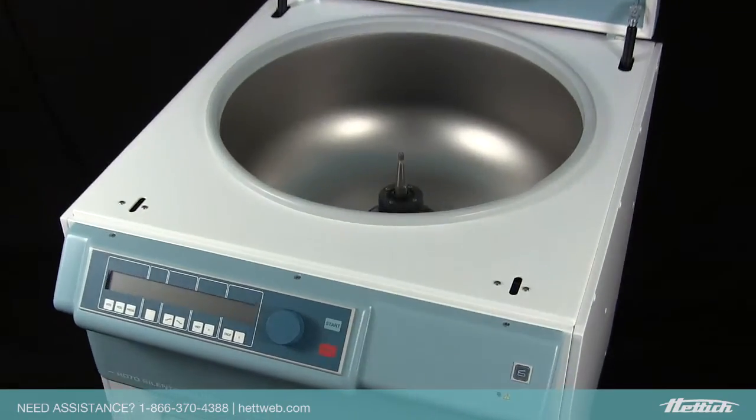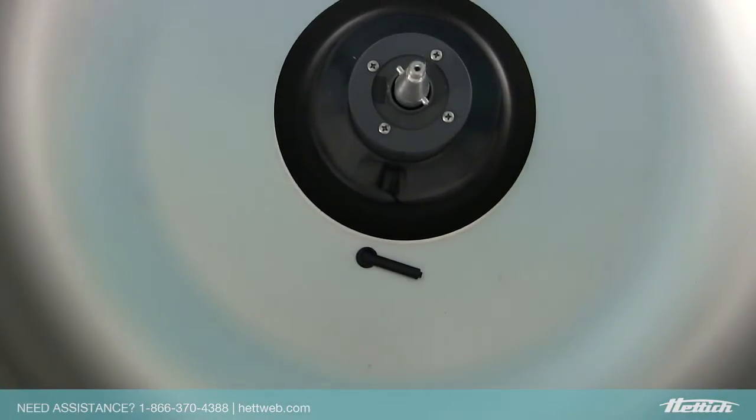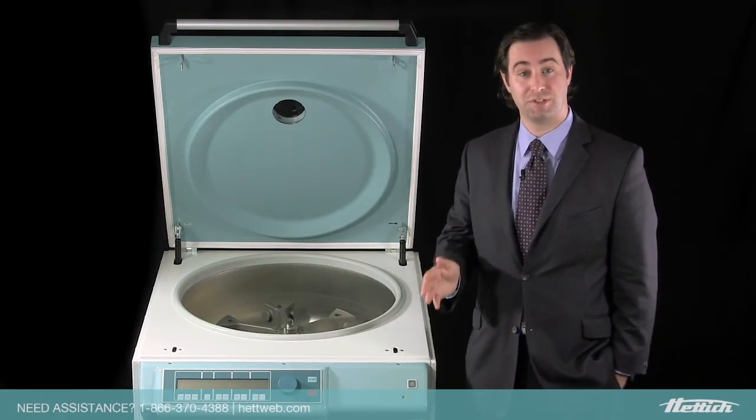With dual temperature gauges and a more powerful motor, the Celenta distributes its force and cooling more effectively and evenly around your samples than with traditional windshield systems.